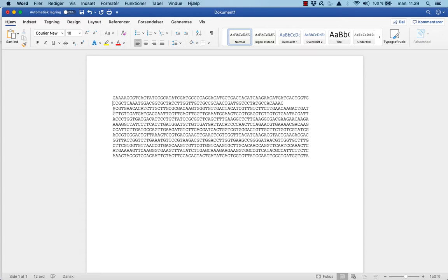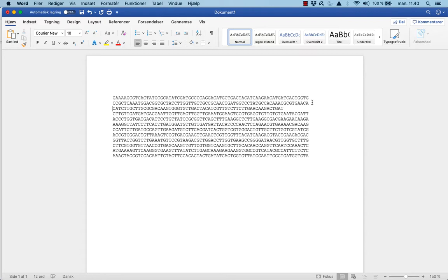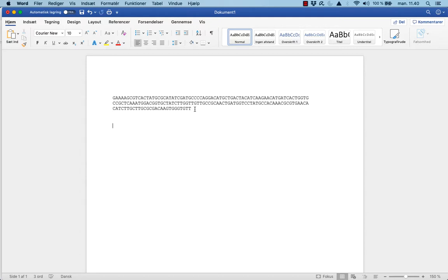So what I'm doing now is just getting the sequences in place. So this is 120, 24. Here we are. So here we have our sequence, which is going to be the PCR product we will amplify upon.